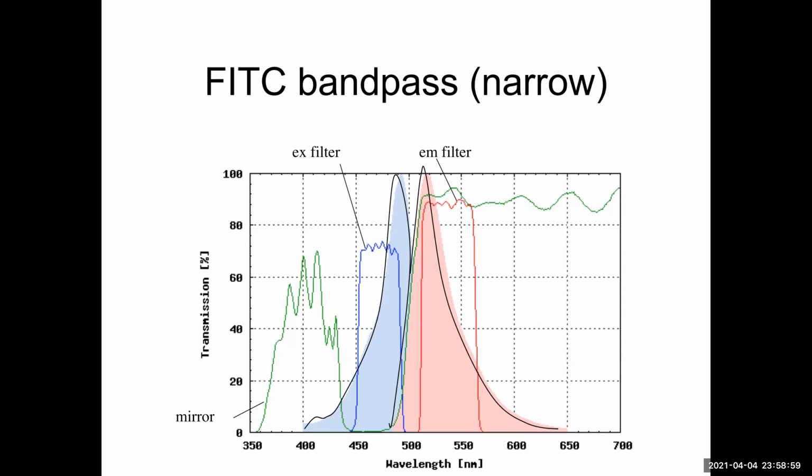In emission, it's how much light is created, and excitation is its response to that light. But it's basically how strong, how much light. We don't deal with the y-axis a lot because there's not a lot you can do about it, to be honest. But we look very carefully at the axis of the colors.